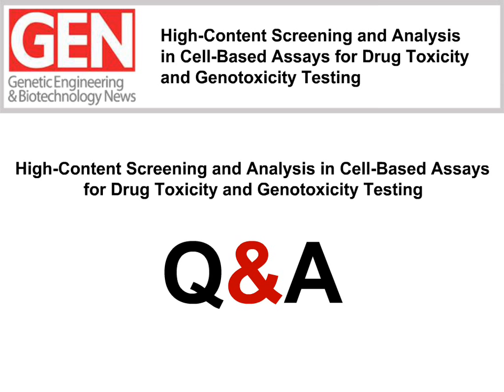And this is in particular very interesting for MSCs because it suggests an important repair mechanism of those cells, those stem cells. And this for sure would represent a more physiologic model to test the effect of platelet lysate. But at the end of the story, we were unable to induce any micronucleation. So the signal window between the control and the induced cells was too low to make any final conclusion.